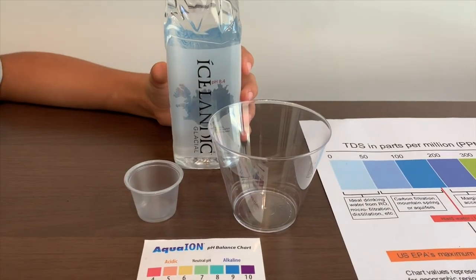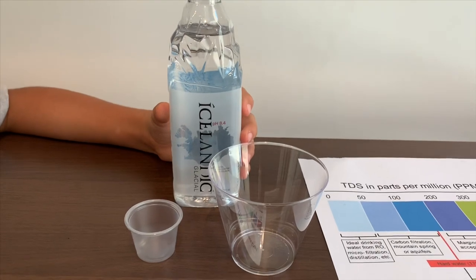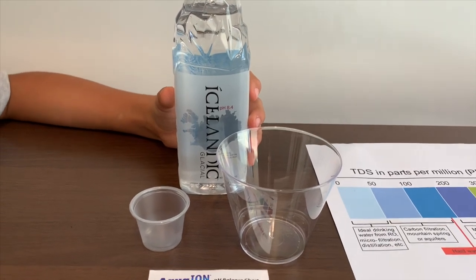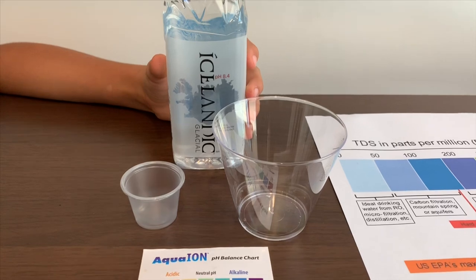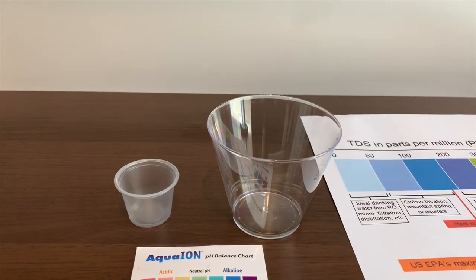This is Icelandic Glacier. It is natural spring water from Iceland and it says its pH is 8.4. Let's test and see if they're right. It is $1.29. Let's pour some in.